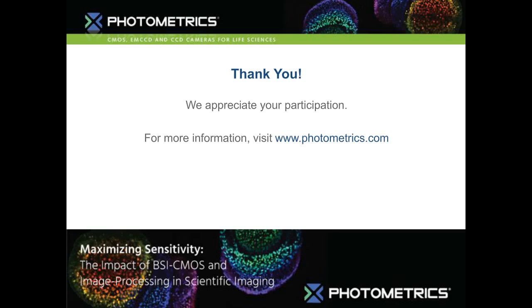And the first question is, can you explain more on the impact of pixel size? Larger pixel size has higher capacity, larger dynamic range, but not necessarily more sensitive or less noisy, correct? So that's generally correct, yes. The larger the pixel size, the larger typically the capacity for that pixel to be able to hold higher levels of signal.